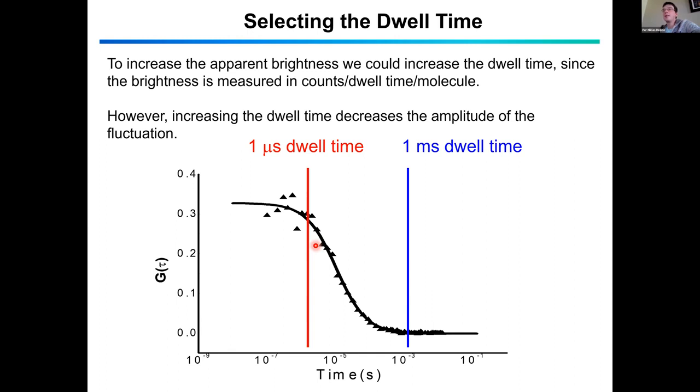However, it can become a problem with camera-based systems, because with cameras you acquire the full image in one shot, but you expose all the pixels for a longer time, maybe 10 milliseconds or even 100 milliseconds. In this time, the molecules, for example if they are moving fast in the cytosol, have plenty of time to move around and average out your signal fluctuations.